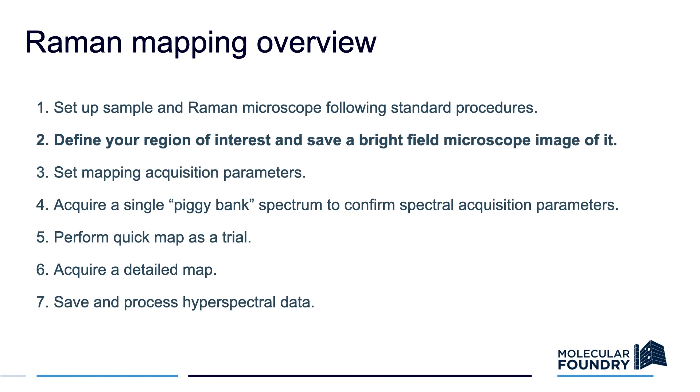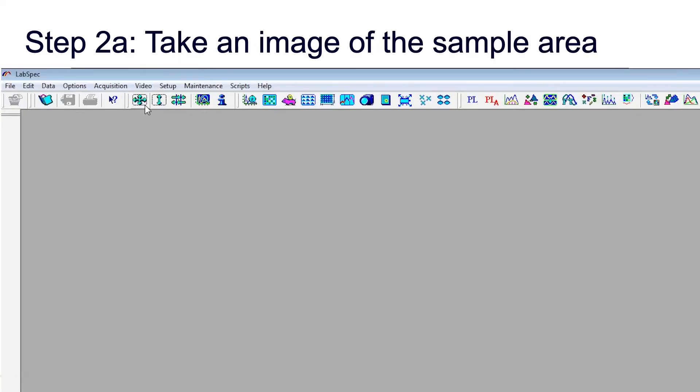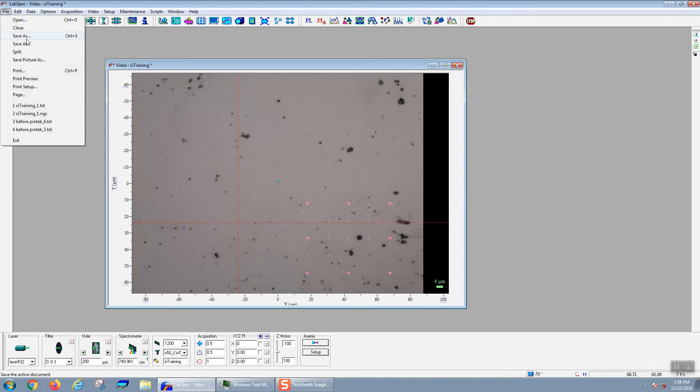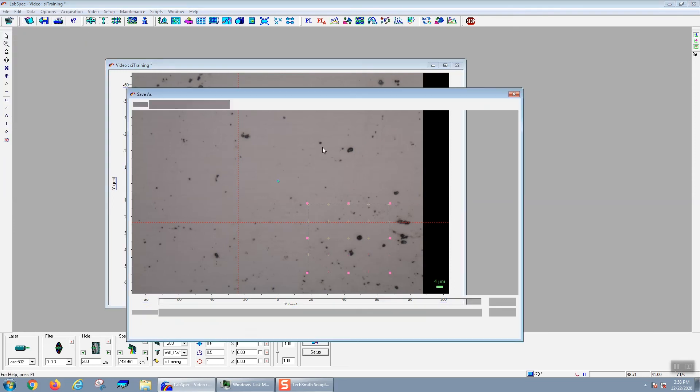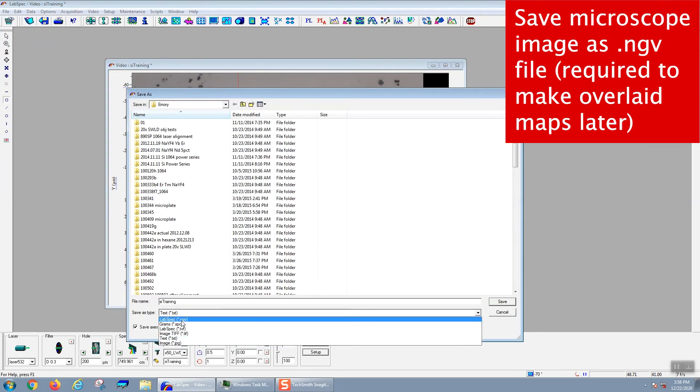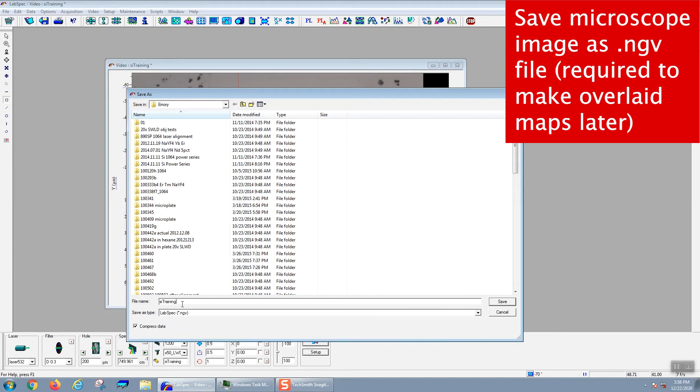Step two, defining our region of interest and saving a brightfield microscope image. Once you've set up the Raman microscope and your sample, you want to use the camera icon to take an image of your sample around the area that you want to map. Once you've stopped the camera to freeze that image, you can go to File Save As to save your image in the .ngv format. It's important that you save it in this format because this allows you to overlay your image onto your hyperspectral map.